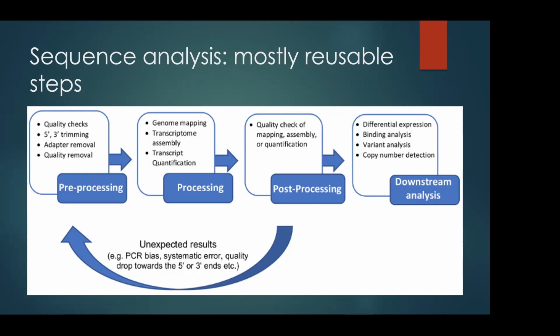So that's why what I usually tell people is this. First, use the best annotation you can find, align them to the transcriptome using RSEM or other programs, quantify them, and get your tables. So this is one thing.